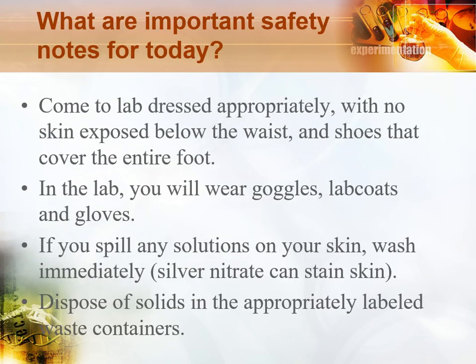When you do this experiment, I had to come to lab dressed appropriately. I had no skin exposed below the waist. My shoes cover the entire foot. I did wear my eye protection, a lab coat, and gloves. If you spill any of the solutions on your skin, you should wash them immediately. We're not working with anything particularly dangerous today, but the silver nitrate can stain your skin, so you want to make sure that you are definitely wearing gloves when you handle the silver nitrate. And you want to be sure that you dispose of solids in the appropriately labeled waste containers.